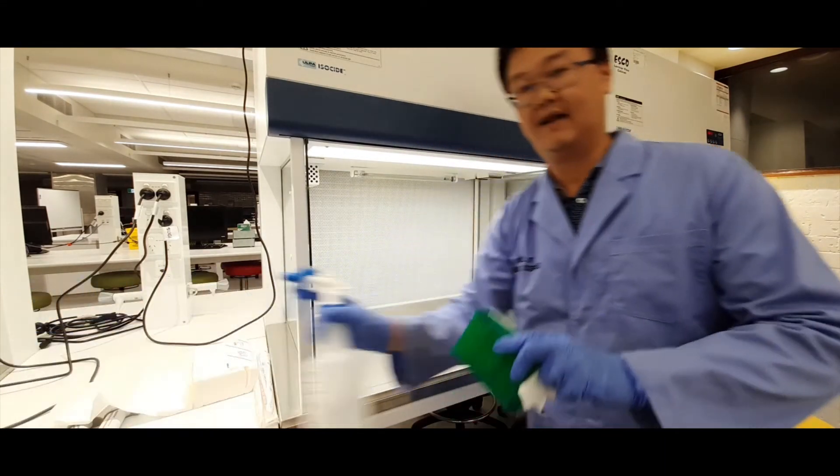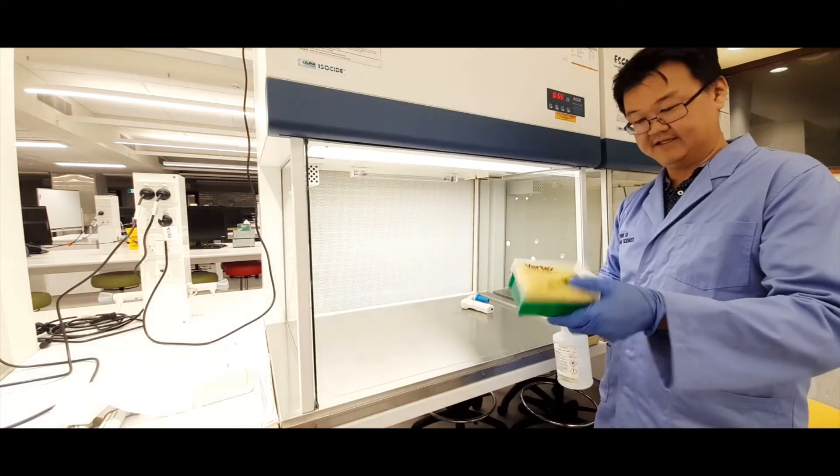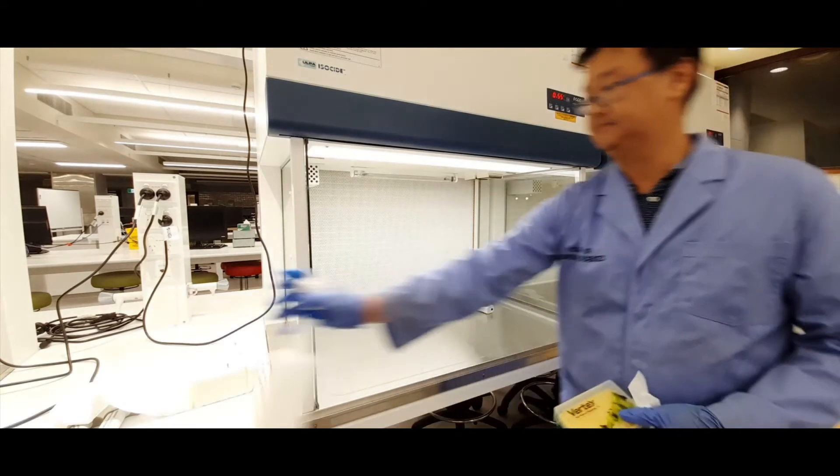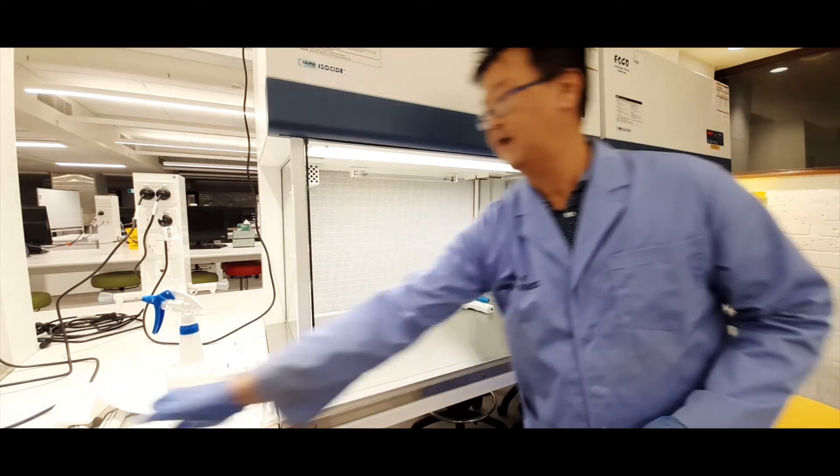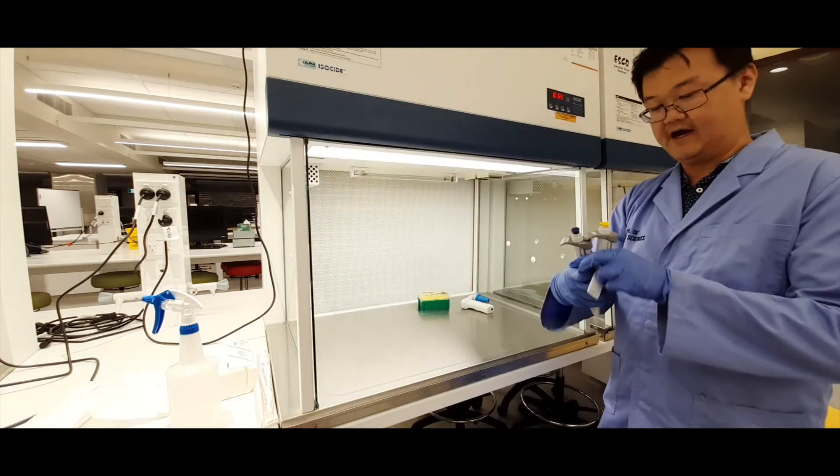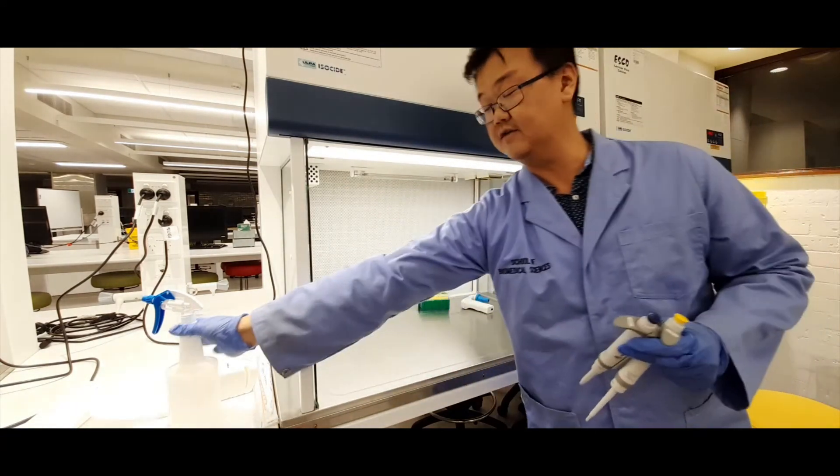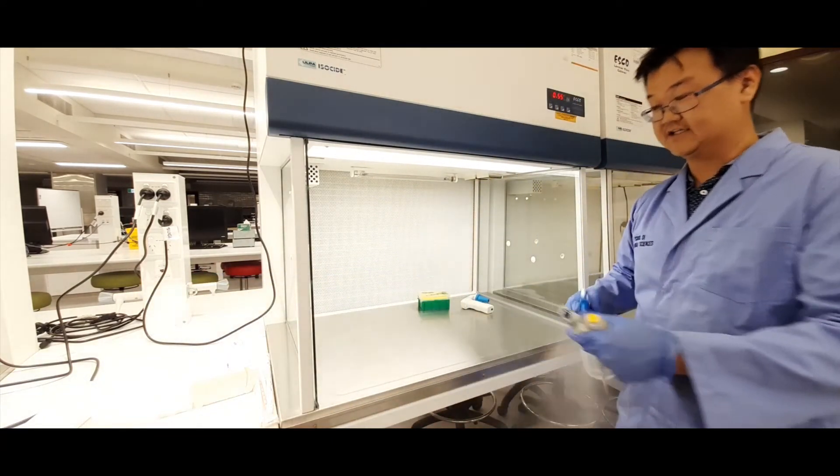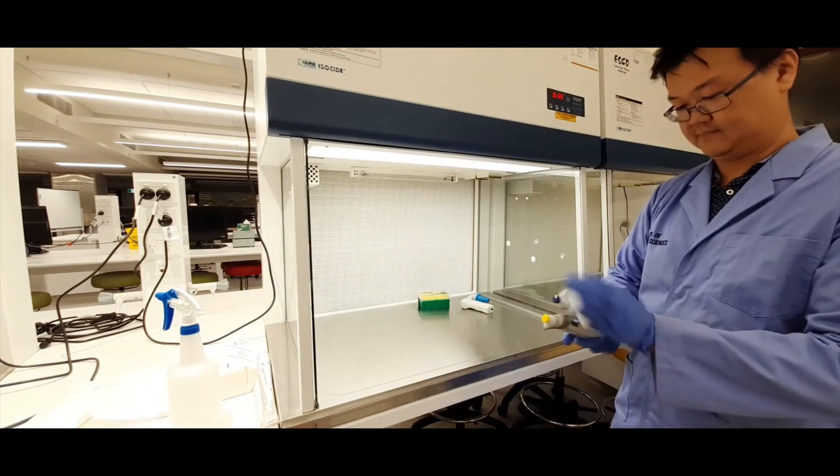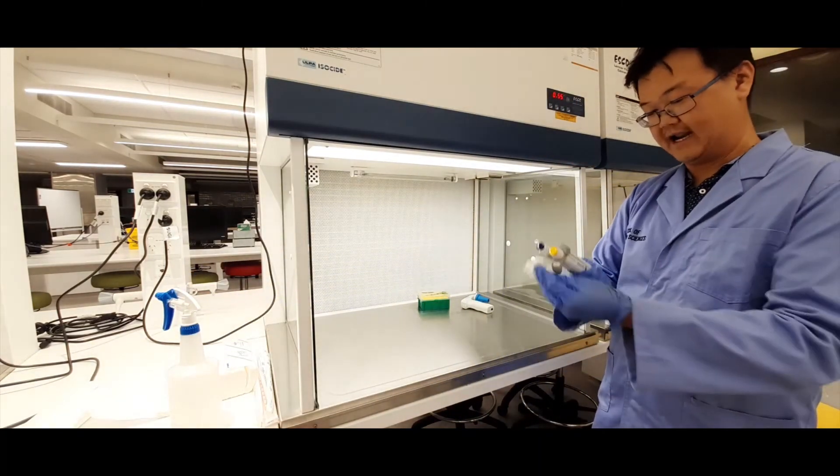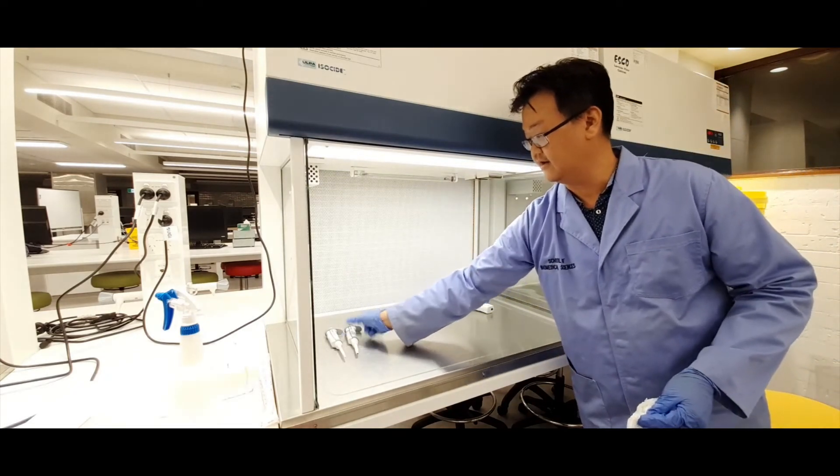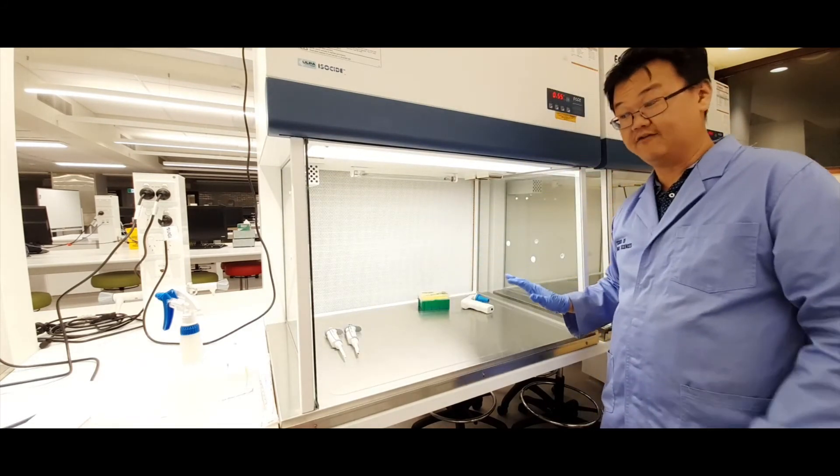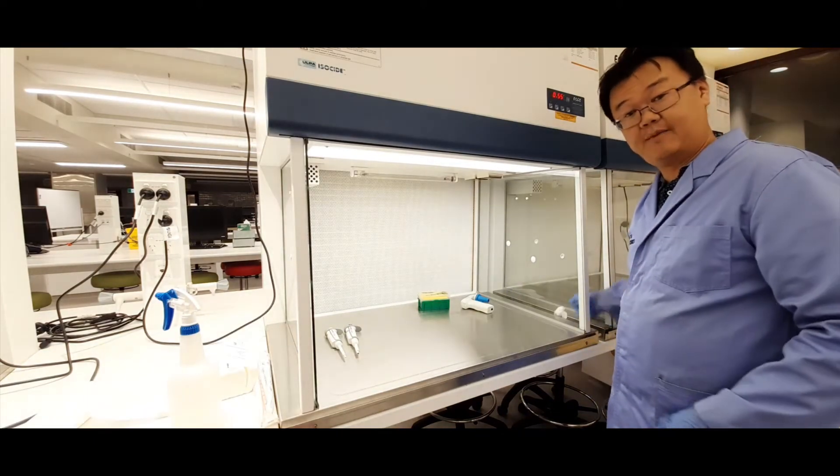You should do that with something like a tip box as well. And here I've got a couple of automatic pipettes that I might be using for an experiment, so we'll just give that a spray, wipe down, and then position that in that work surface ready for your cell culture experiment.